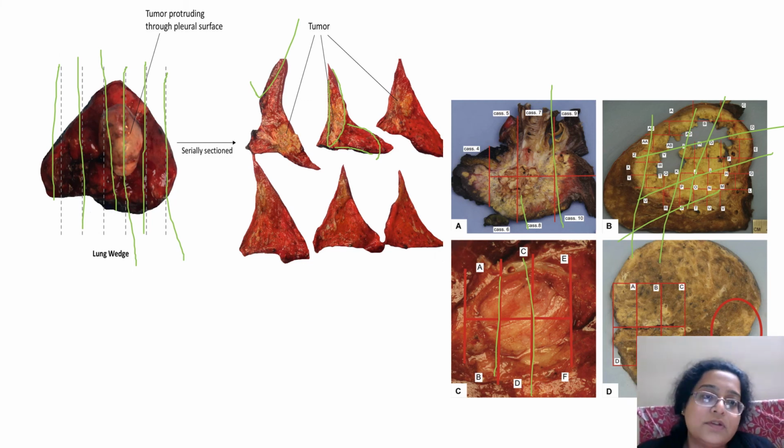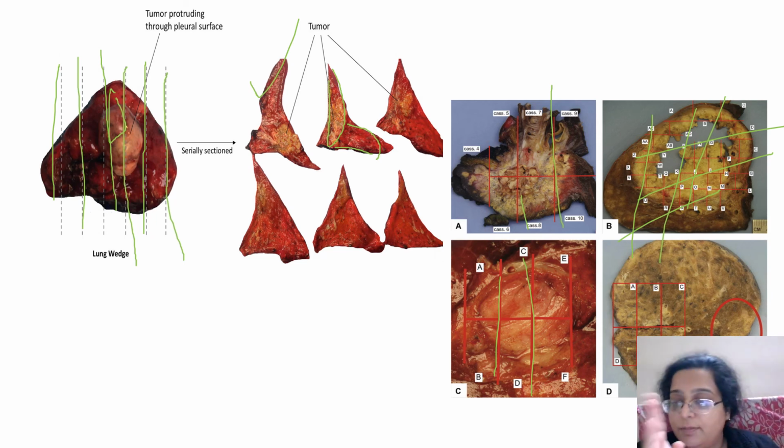You just can't start going, okay, it's a section so we'll take from here and that's it. No. First cut it parallel to see the extent and then take out one section, and then as I told you, margins are important.